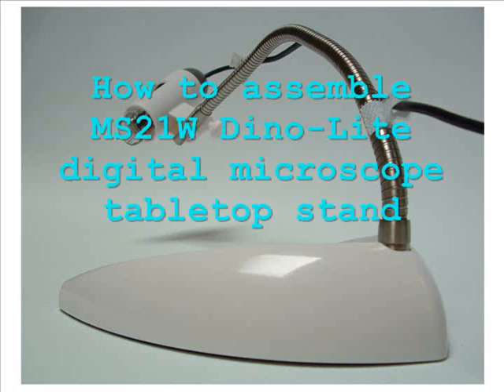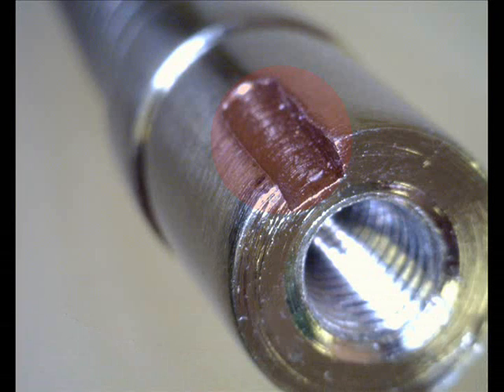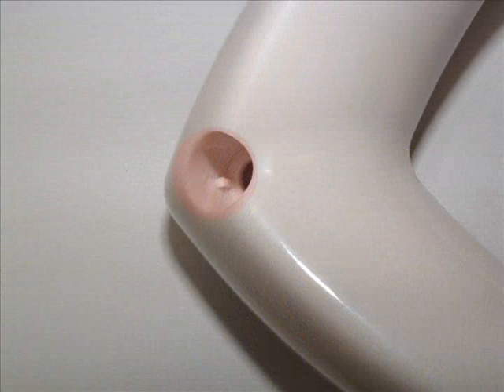Here is a tutorial on how to assemble our MS-21W desktop stand. First, notice that there is a notch at the end of the tube. There is another notch that is on the base of the stand.